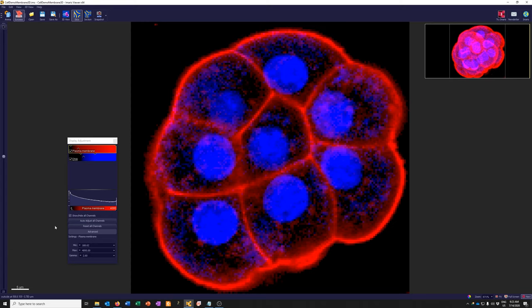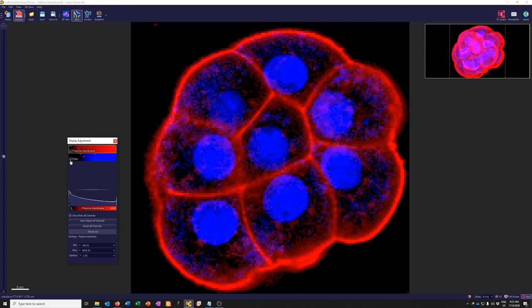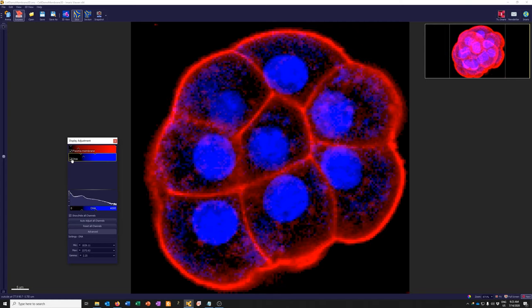There's a lot going on in this window — let's go through it one element at a time. This window shows as many channels as are present in the data, and you can turn the display of those channels on and off by hitting the check marks. For example, we can turn off the channel called 'plasma membrane,' turn off 'DNA,' or even turn them both off. That's the very basic thing you can do — turn channels on and off.